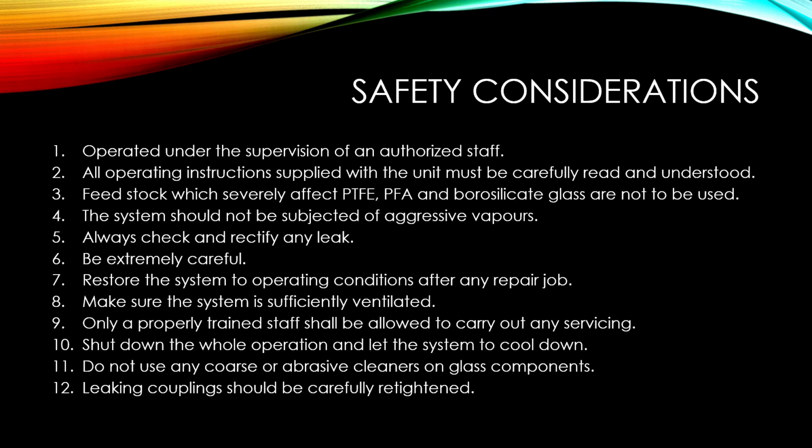Safety consideration: the unit must be operated under the supervision of an authorized staff who has been properly trained to handle the unit. All operating instructions supplied with the unit must be carefully read and understood before attempting to operate the unit. Feedstock that severely affects PTFE, PFA, and borosilicate glass must not be used.